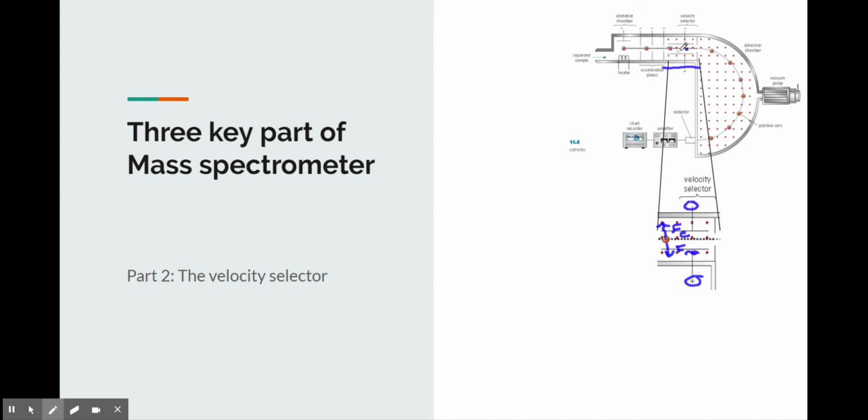So what we do in the mass spectrometer is we inject and we accelerate these multitudes of charged particles, and when they enter this region, the reality is some of these things have more electric force on them, some have more magnetic force, and those things will bend. But what we're curious about is the particles that will head straight on through here unaffected.